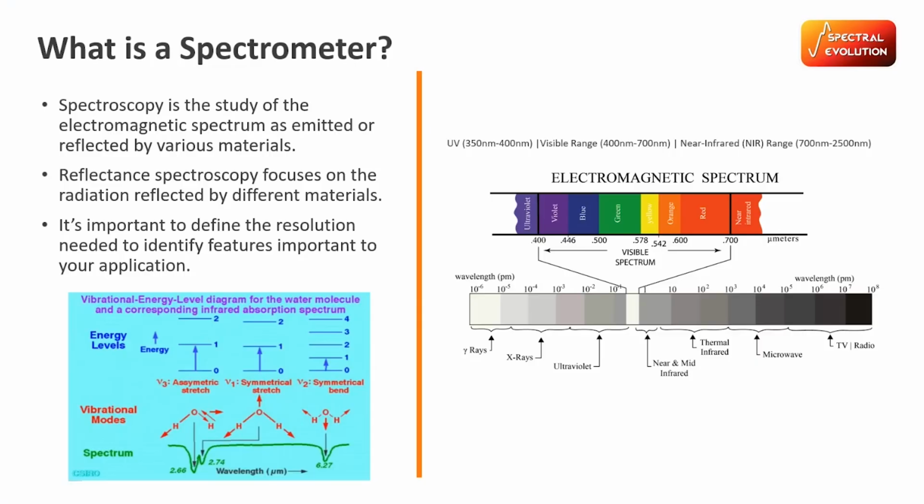With proper radiometric calibration, a spectrometer can become a spectroradiometer and can accurately measure energy across the range, allowing us to identify materials based on their unique spectral signatures and measure energy actually coming down and hitting an object as well.